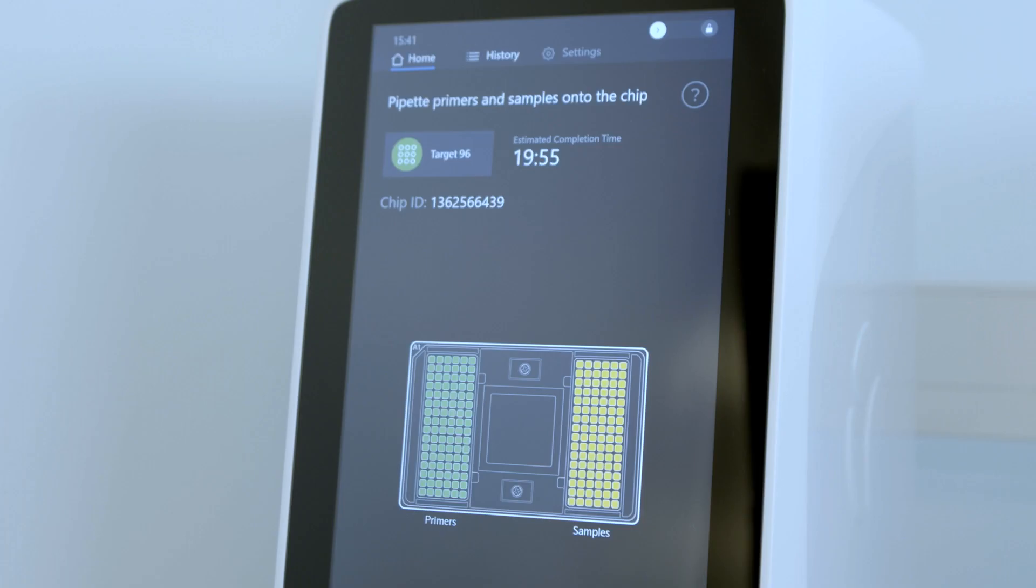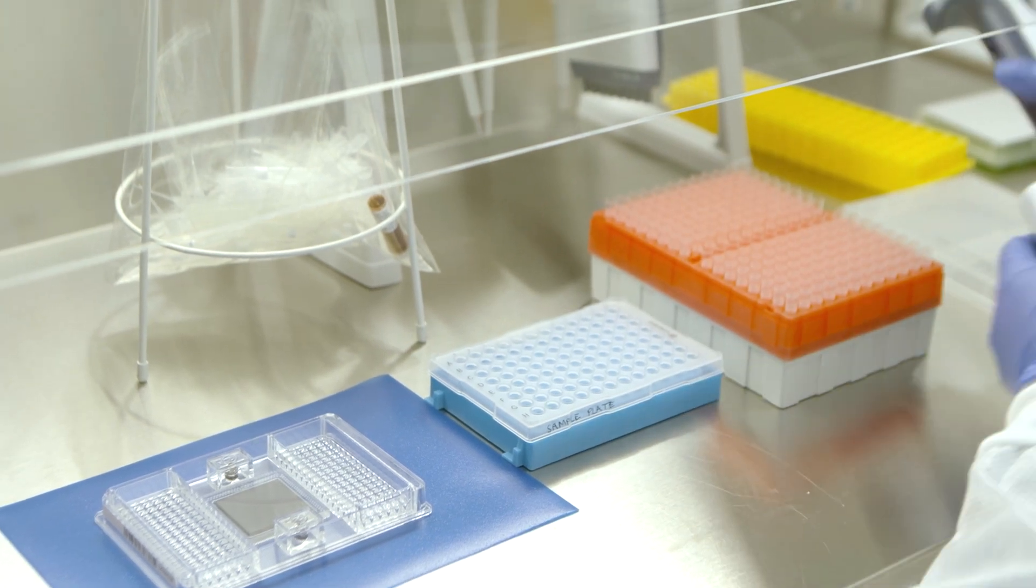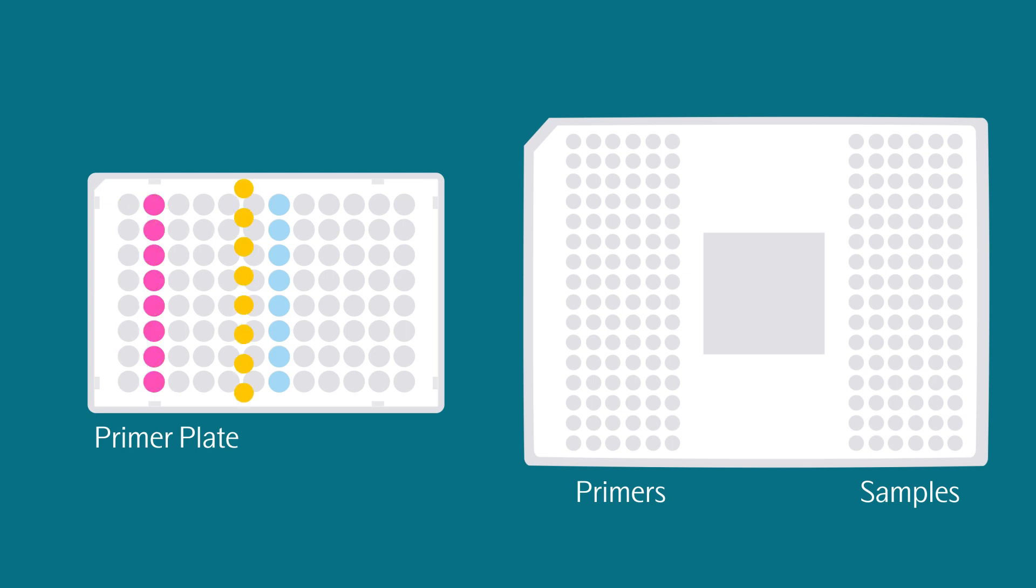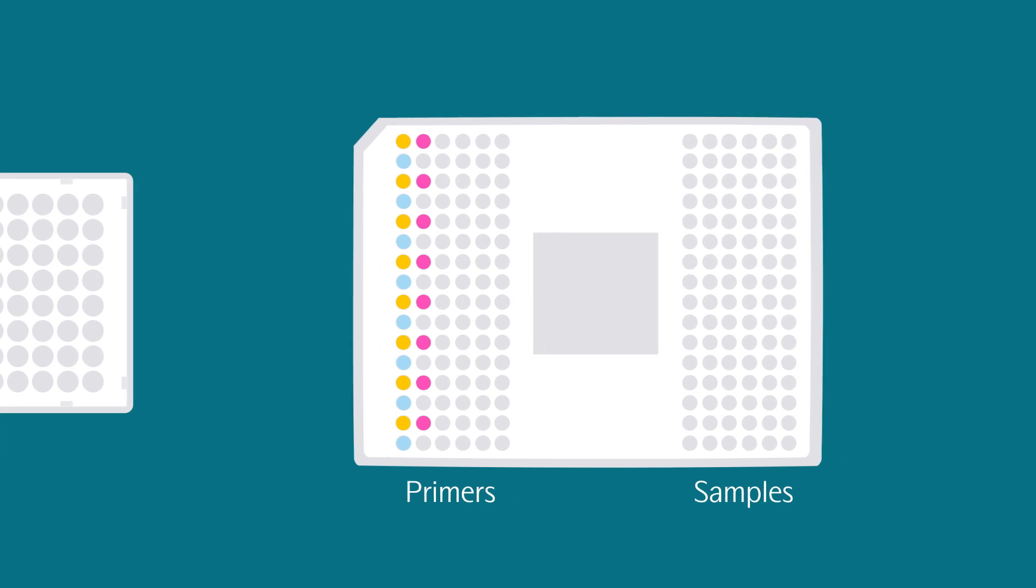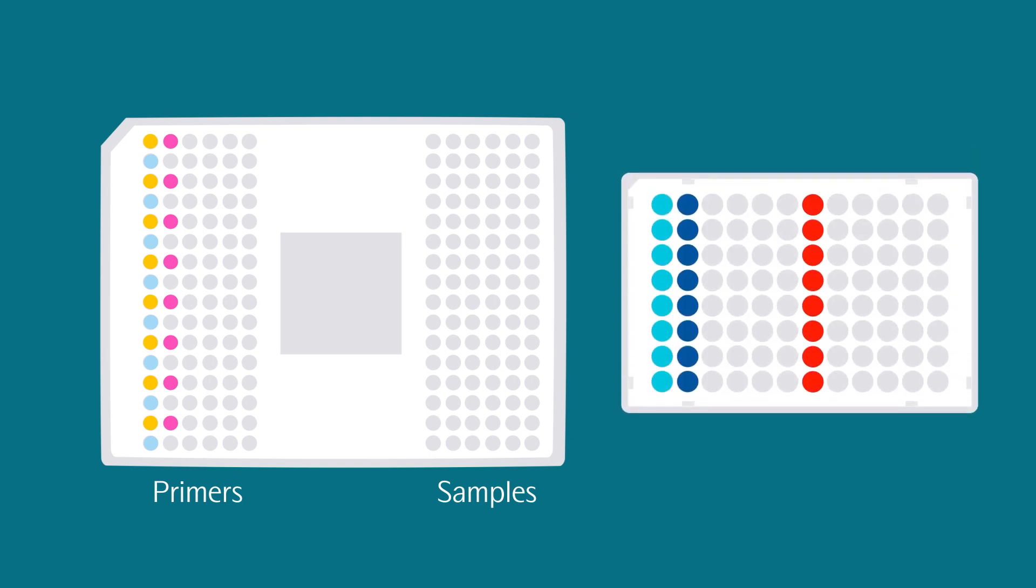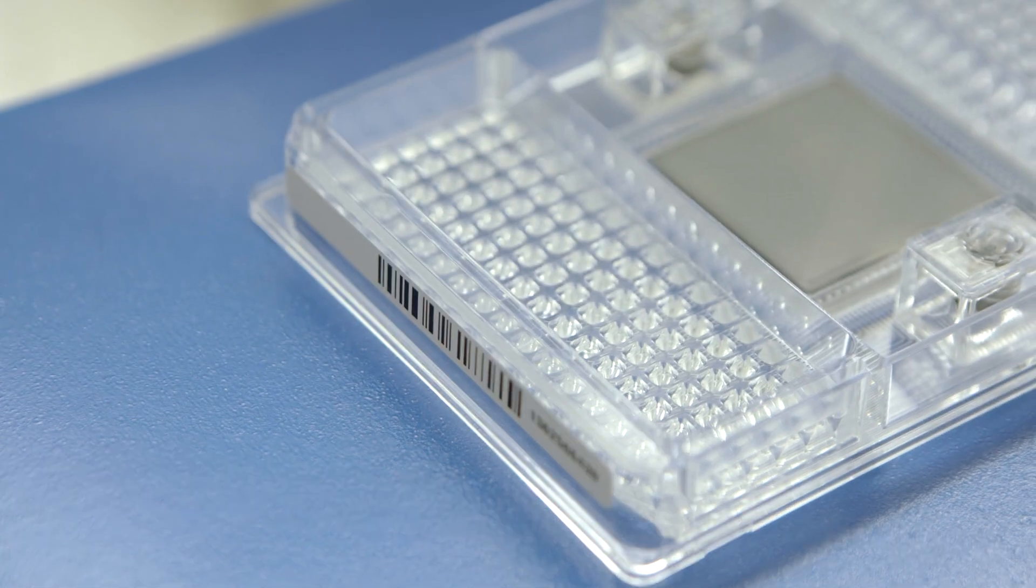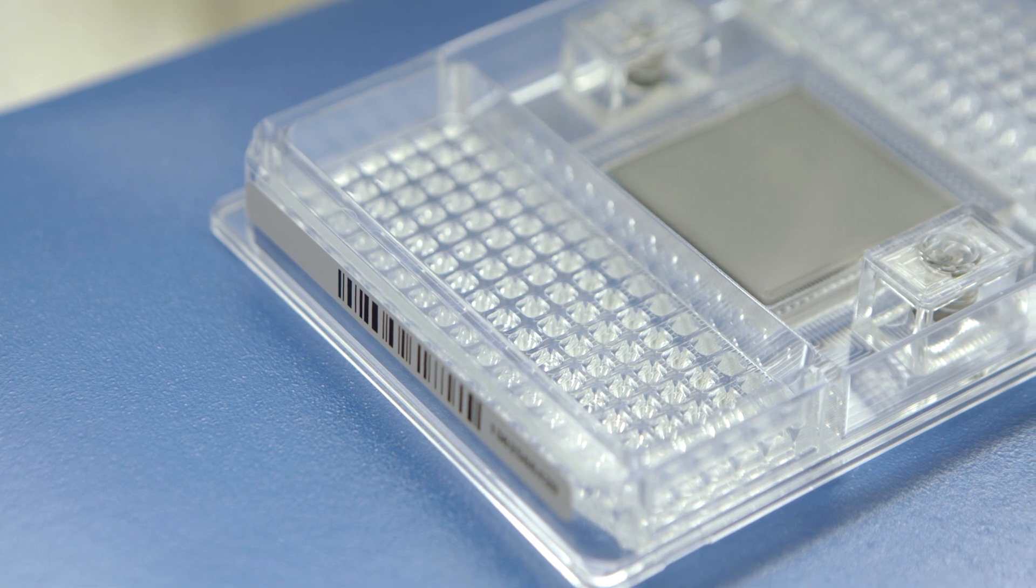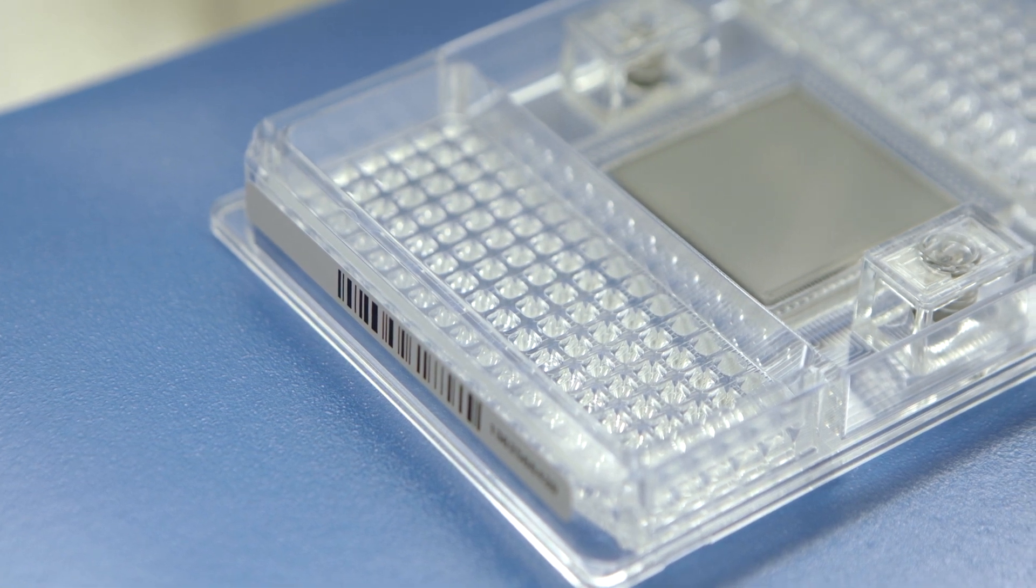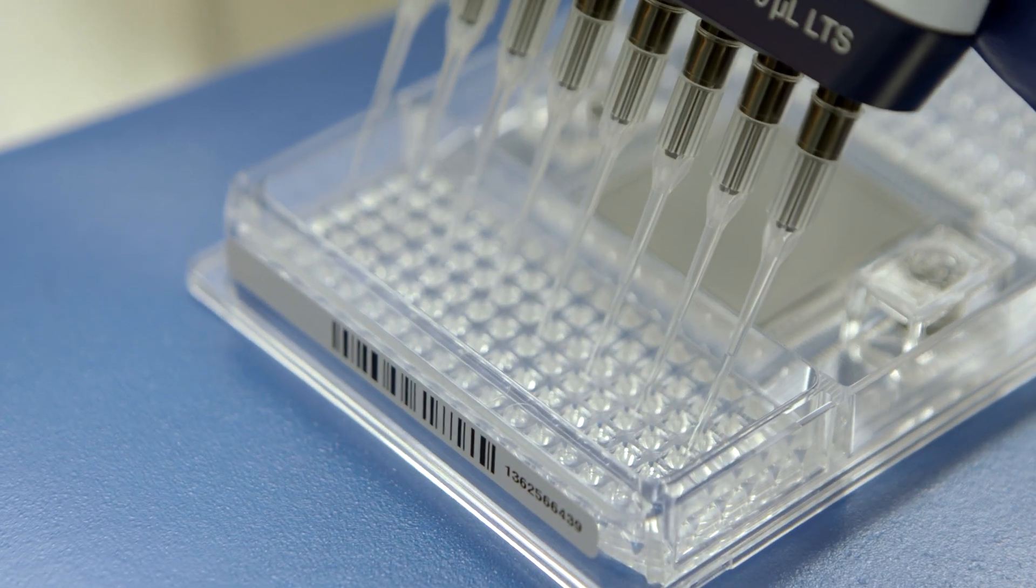The next step involves loading the primers and samples onto the Target 96 IFC. Using reverse pipetting, pipet 5 microliters of each primer into the respective primer inlets on the IFC on the left-hand side. Using reverse pipetting, pipet 5 microliters of each sample into the respective sample inlets on the IFC on the right-hand side. Carefully check for bubbles in both the wells for primers and samples before proceeding. If any bubbles are found, they should be removed using a syringe needle. Change needle between wells to avoid contamination.